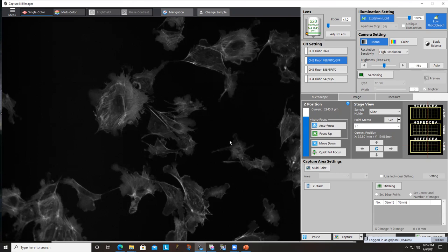But for all the quantification that we want to do, stick to one objective, stick to one imaging parameter, and your choice of the imaging parameter will depend on you looking at your different samples at the same time. So for example, look at your positive control and see what is the maximum intensity you get out of it, right? And set your imaging parameters based on the max intensity you need. Then you go back to your negative control and see whether the dynamic range we are getting is good enough to get the low values in your sample. So it's going to be a fine interplay between getting your lows and getting your highs, and settling for that parameter. Does that make sense? Yeah, sure.